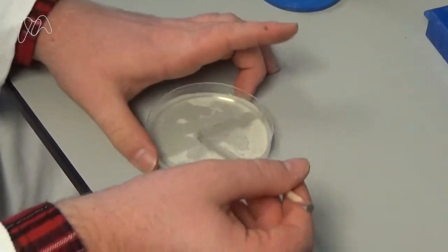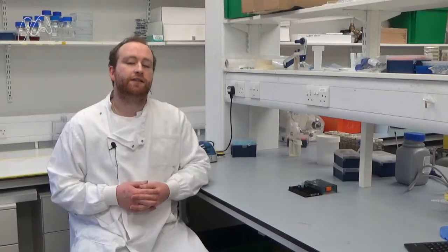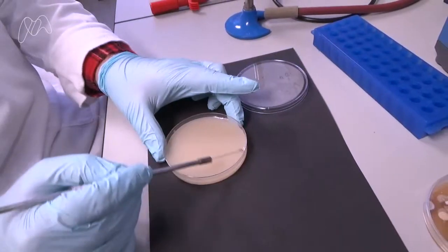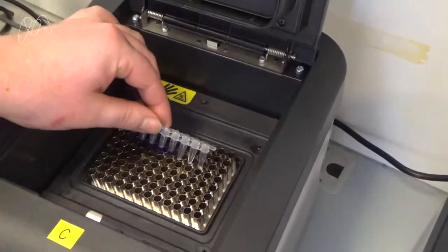First, we mixed the soil with the water and spread it onto a special kind of jelly called agar. Then, we picked the bacteria of greatest interest to us and separated them from the rest using a technique called streaking.